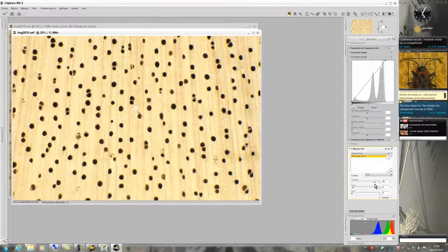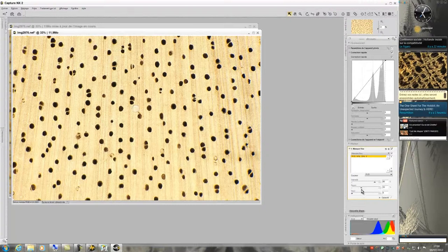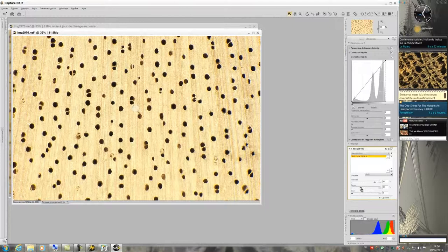You can see the good improvement of the sharpness of the picture. Now I can save and close my picture.